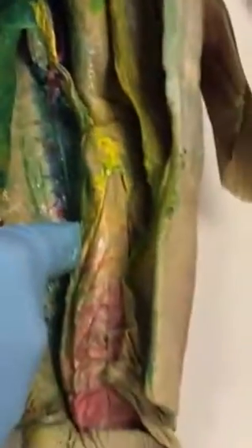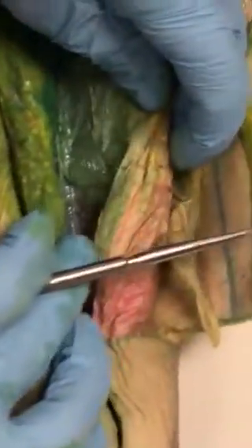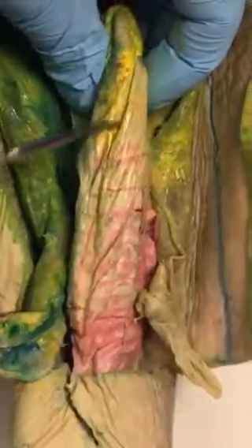No, that's the anterior intestinal artery and vein. Sorry. Okay, so the anterior ones are kind of hard to see on mine because it's so brightly colored, but the artery is the red line that goes down the side here. The anterior intestinal. Right, that's the red line. It goes across, more towards the bottom side. It's the red line, and then the vein is the yellow line. Mine picked up a lot of yellow instead of blue, but it's the yellow line.